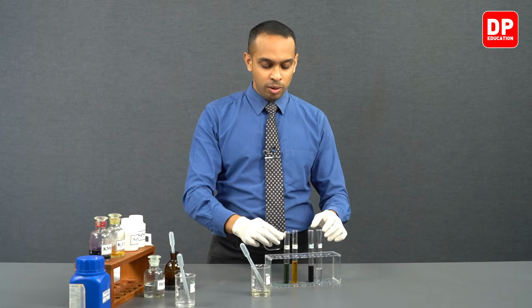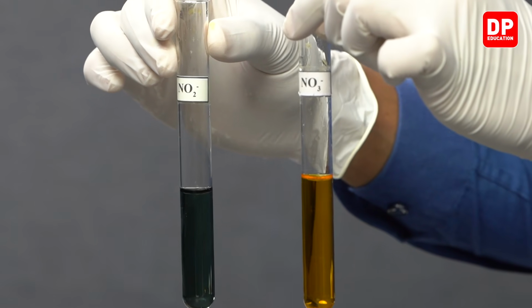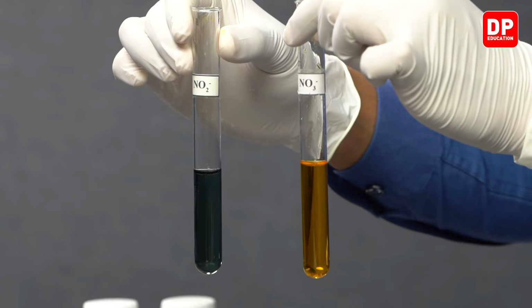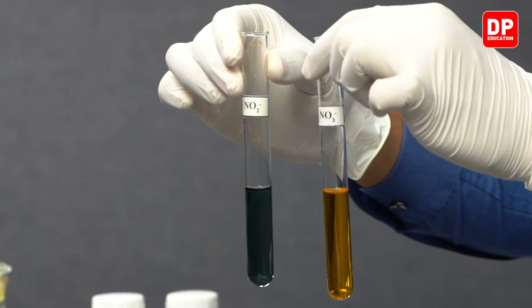So we can observe now, a green color solution was formed when nitrite was reacted with acidified potassium dichromate, but with nitrate ions we did not observe any color change. We can see the orange color of the dichromate remained.